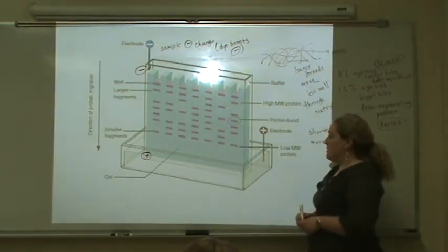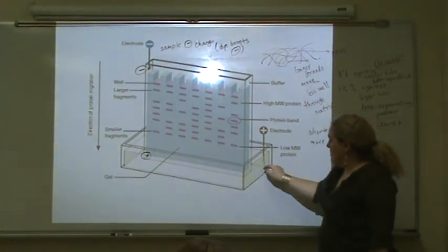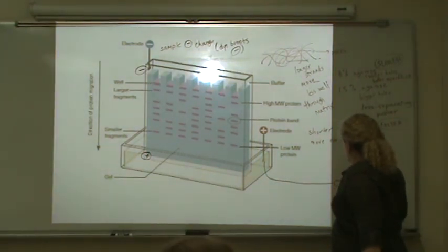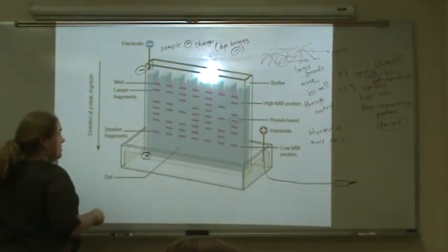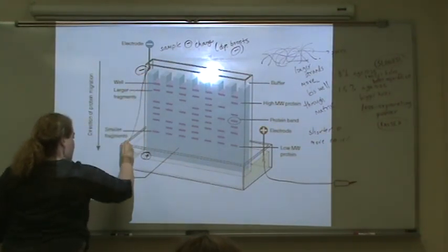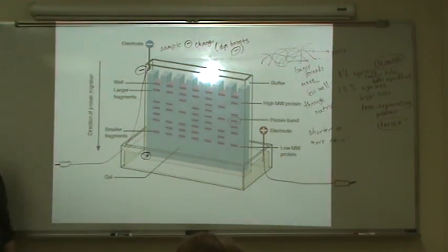Toward the positive end. Every one of these gel rigs, whether they are vertical or horizontal, they have plugs, and this pole is actually usually connected to a plug coming out like this. And the wires don't have positive or negative. The wires are wires.